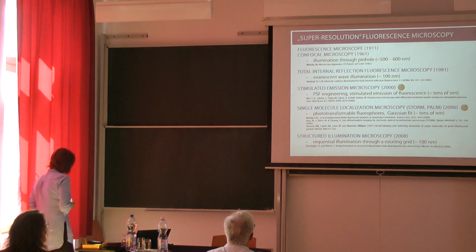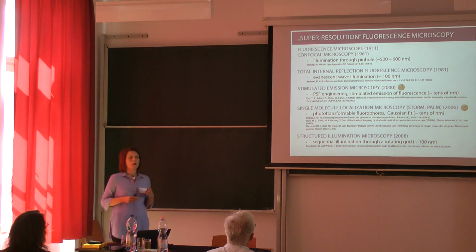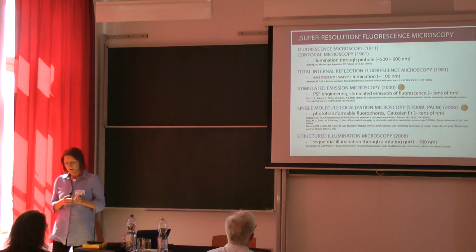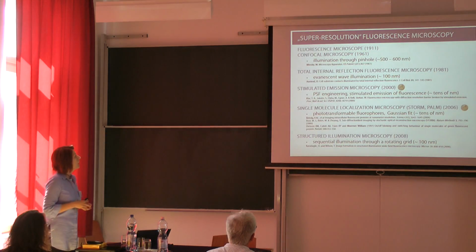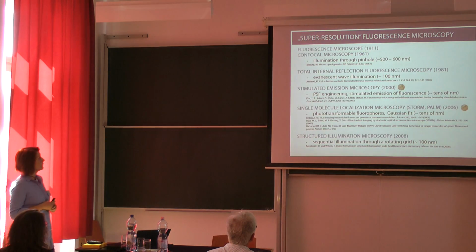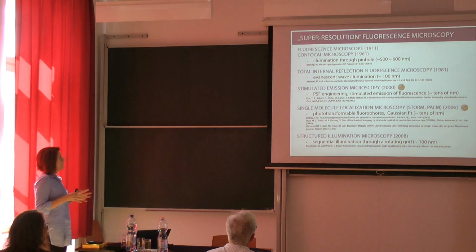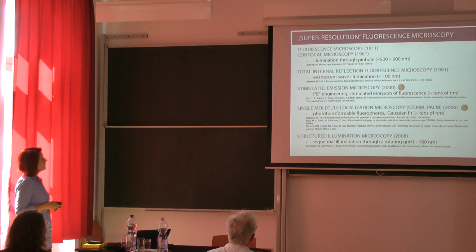Here the improvement of the resolution is based on the use of two lasers. One excites the fluorophores and the other one stimulates the emission before the spontaneous emission from the fluorophores is collected, and therefore the point spread function can be reduced to a few tens of nanometers.